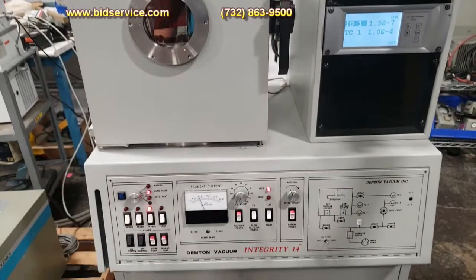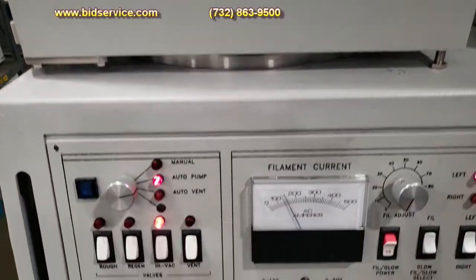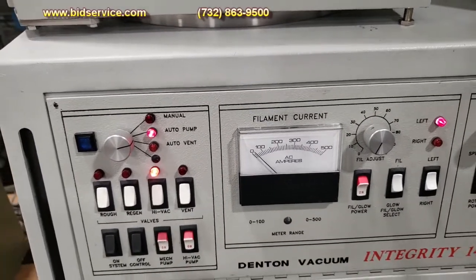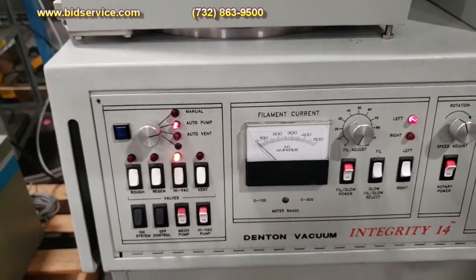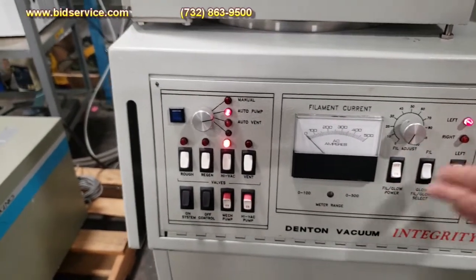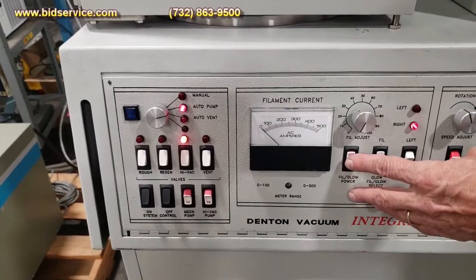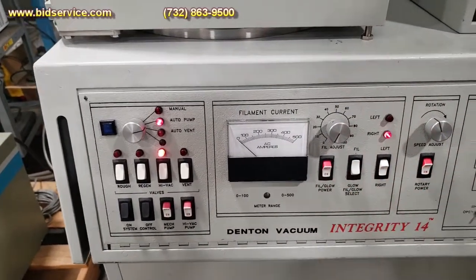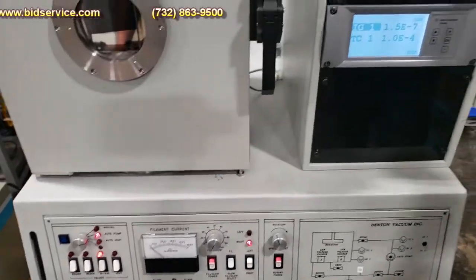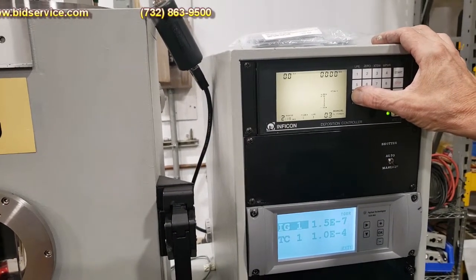I'm going to bring this power down. We'll light up source number two, the right source. Typically you shut the left source off, then switch to right and enable power to your right source. We'll go ahead and start ramping up the power.